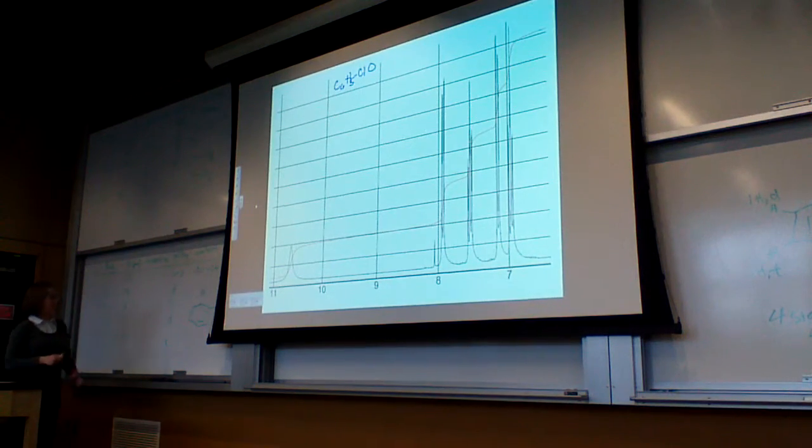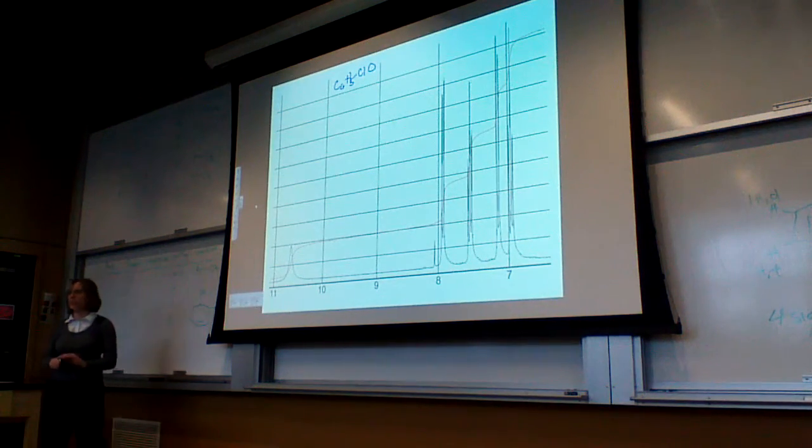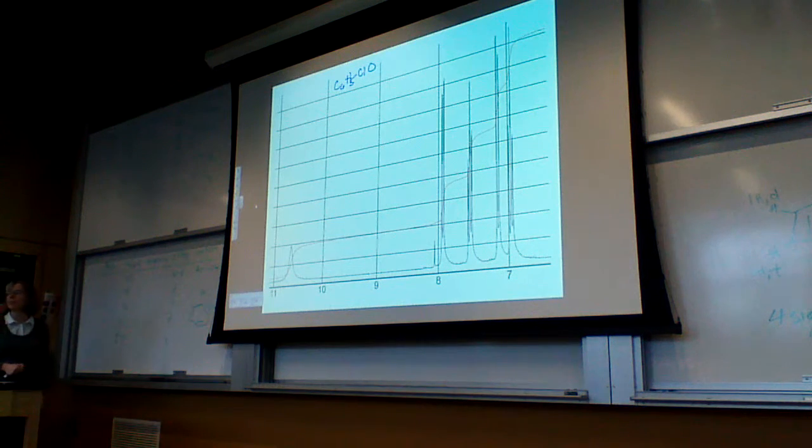So, if you have the right balance of electronegativity, they do spread out nicely like this, but they don't always do that. I had a question. The peak at 6.9, which you call a triplet, doesn't really look like a typical triplet where you expect it to be 3 lines, right? So how would you differentiate?